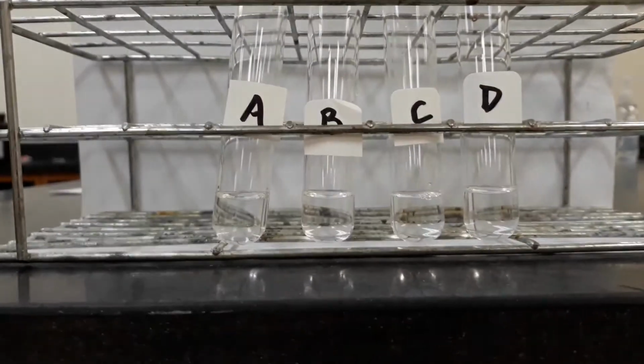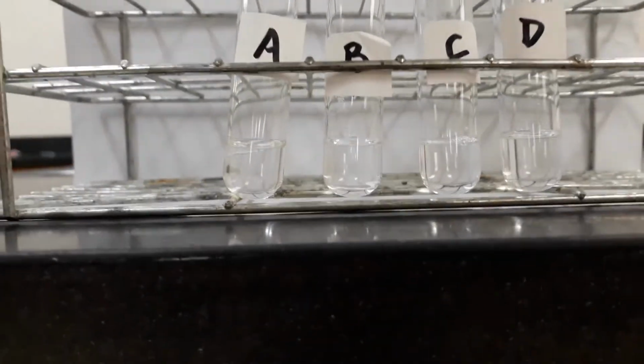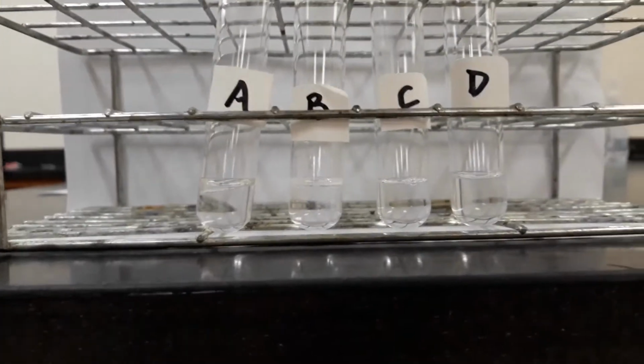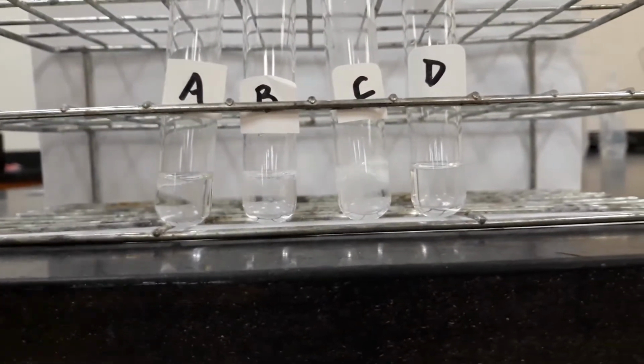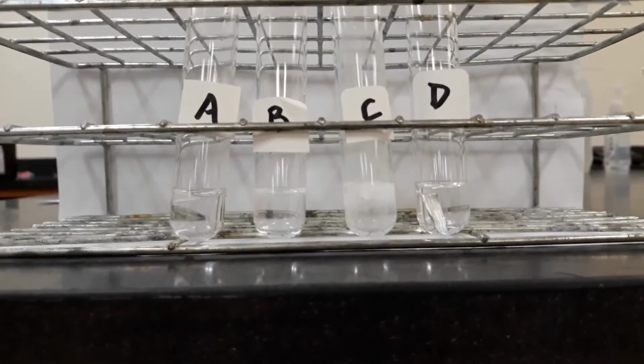So if we zoom in, we can see the reaction rate of A, B, C, and D. And it's fairly obvious.